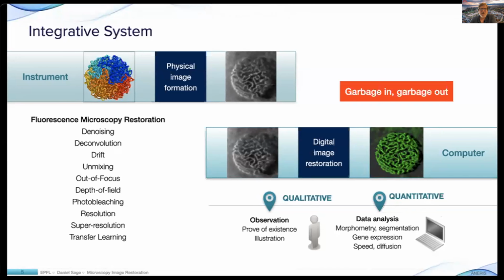And we should never forget the motto: garbage in, garbage out. So if we have a bad image here, we cannot expect to have a very good image after image restoration. Obviously, it's linked to whether the acquisition is good or bad.